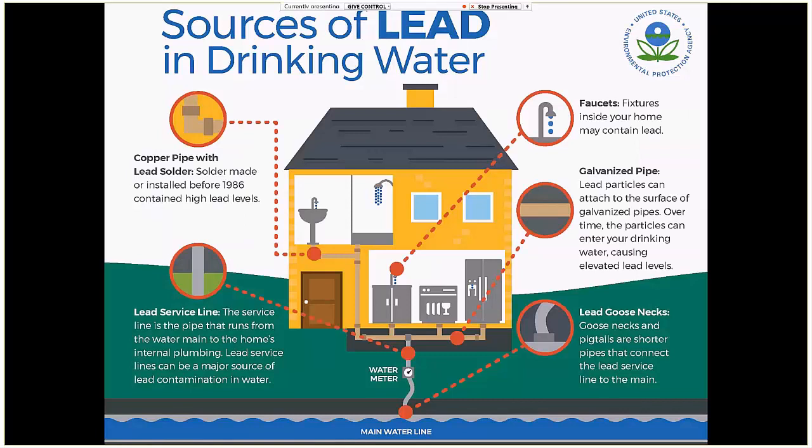Now let's take a little bit of a turn, right? So ammonia, that test works for ammonia, works for chloramine, useful in a wide variety of applications, and it's something that we've been able to take colorimetry and apply it to SERS in a novel way. But then we can start to step back and say, what else is done colorimetrically? Well, lead, there are colorimetric tests for lead. Lead is obviously a big issue, often is due to corrosion in your pipes inside your house or inside your building. We know, as I said, in our office here, there's a lot of iron in our water, likely a lot of corrosion. So something that has been important to us, even with our drinking water here in the office.